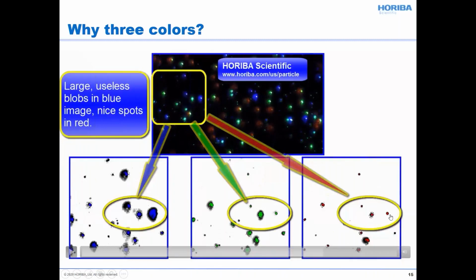Let's jump right to the red. Here we see the scattering. They're nice, sharp, small points, and it's very easy to find the particle locations. Really, to get particle motion, you're finding the particle in each frame. So if you look at the far right red, we're going to get much better motion information compared to what we get from the blue. So for this size particle, we really want to work with the red laser signal because we're going to get useful information. Sometimes this gets much worse in the sense that these blobs will start to overlap each other.